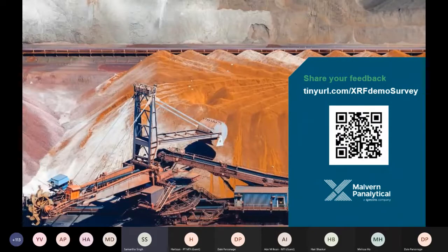So, okay, for you, Dale, I have, what is the general analysis time on the E4?